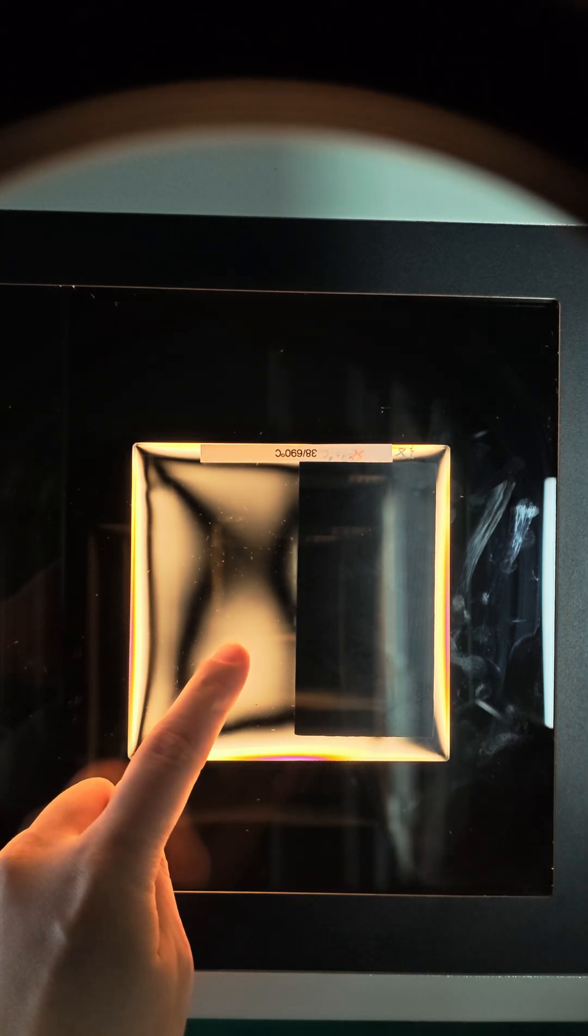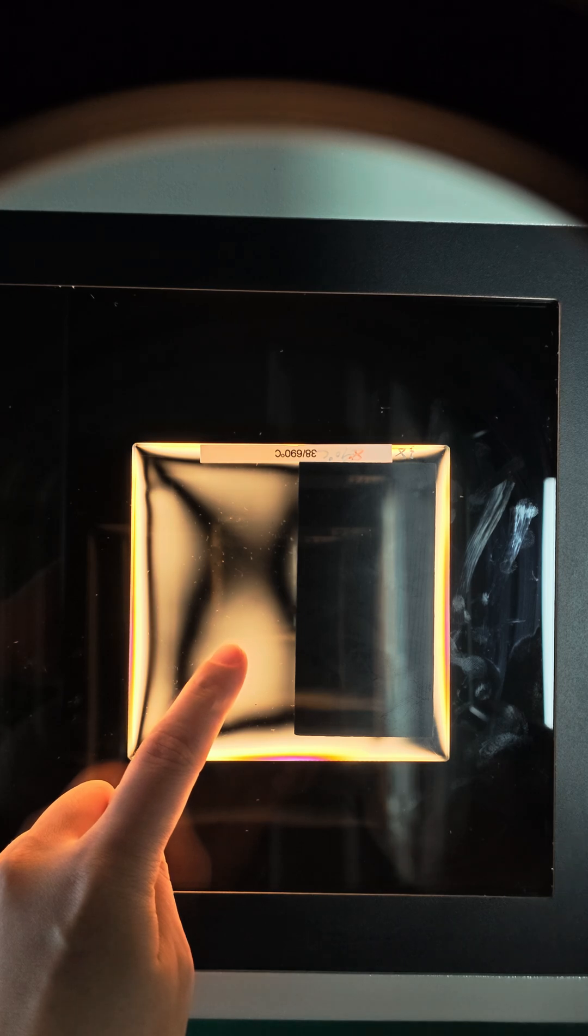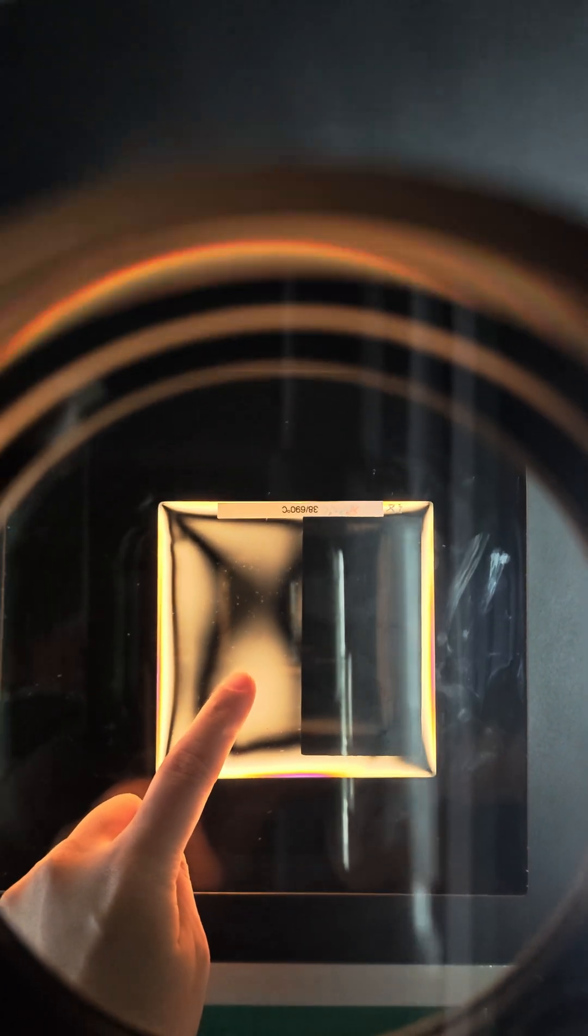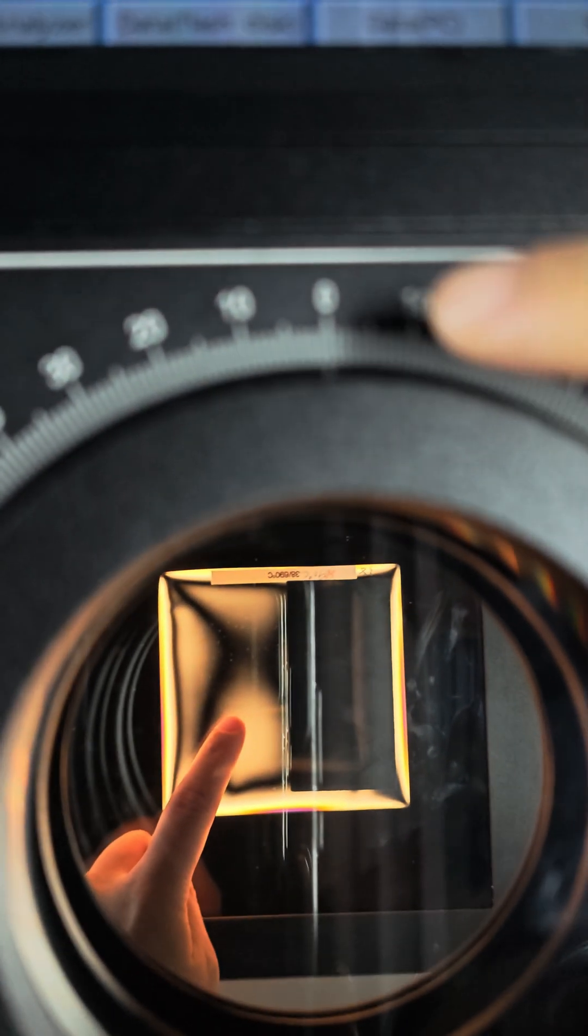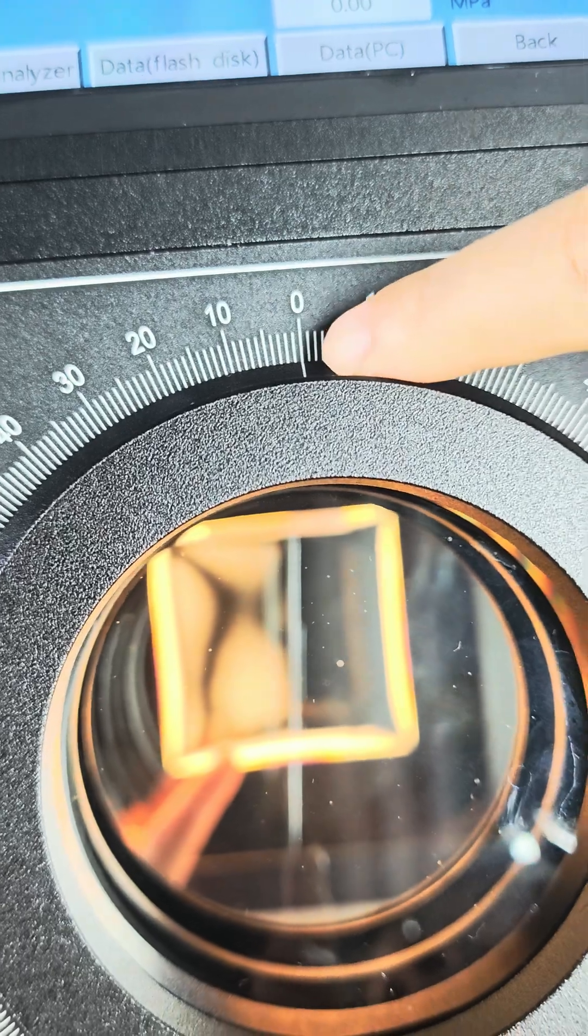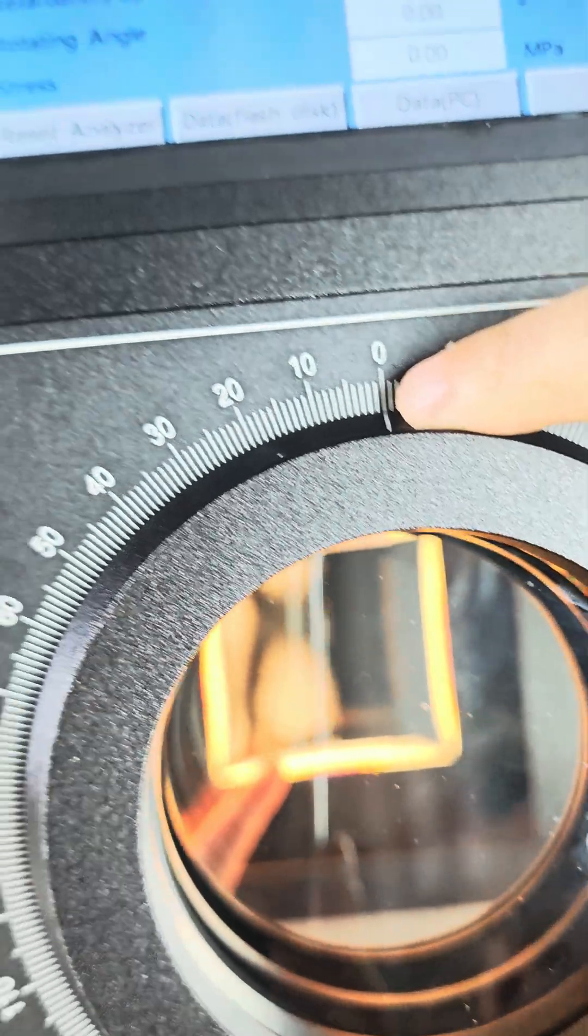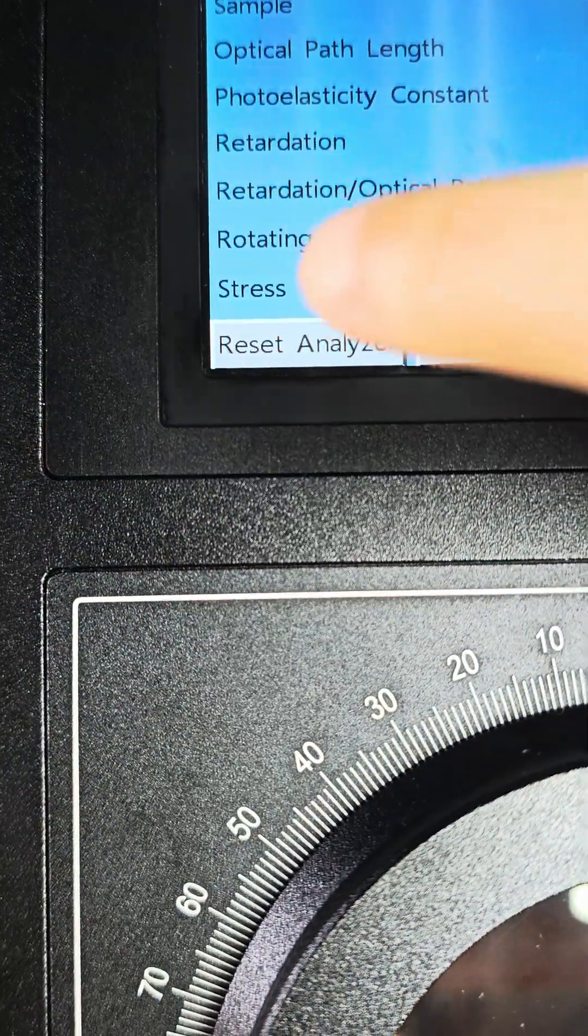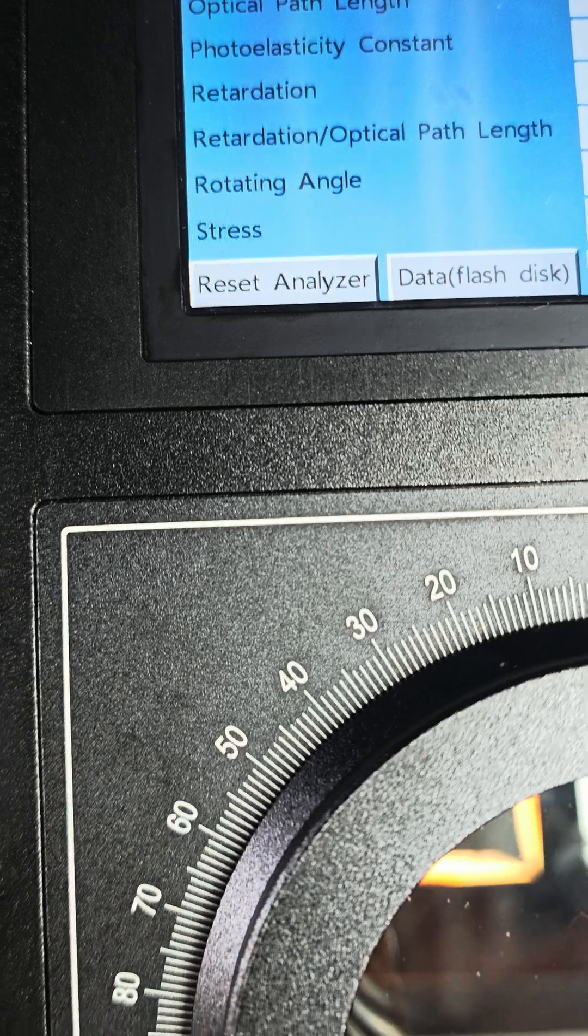Before the measurement, remember to set the analyzer to zero here and press Reset Analyzer button on the screen.